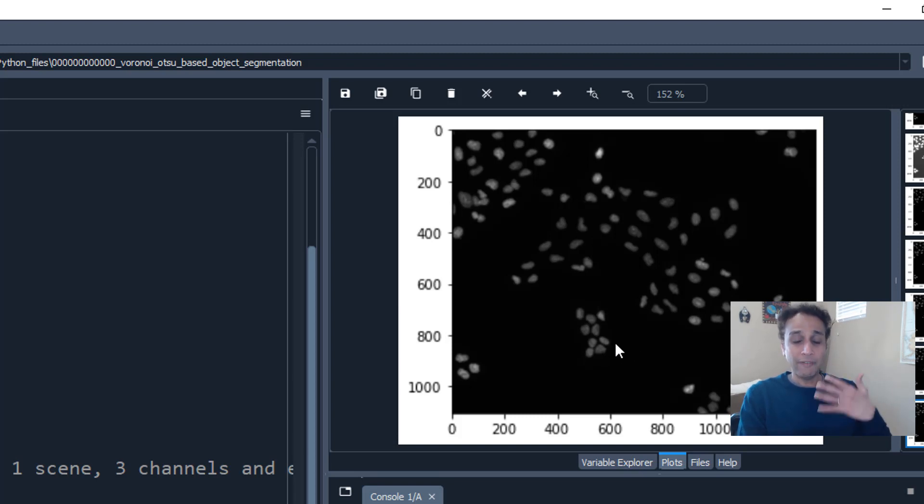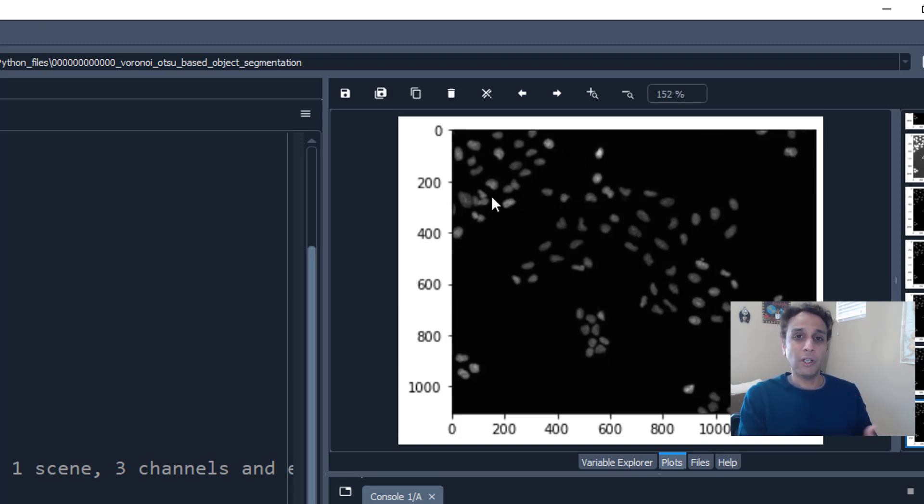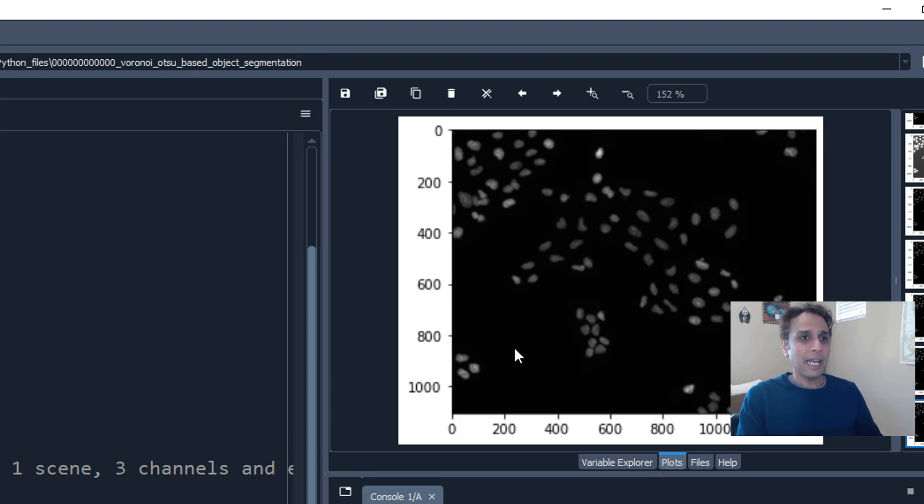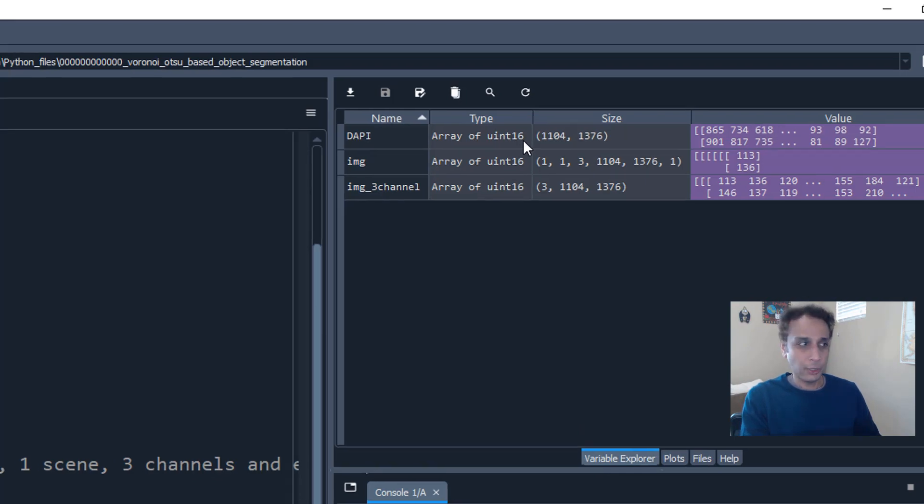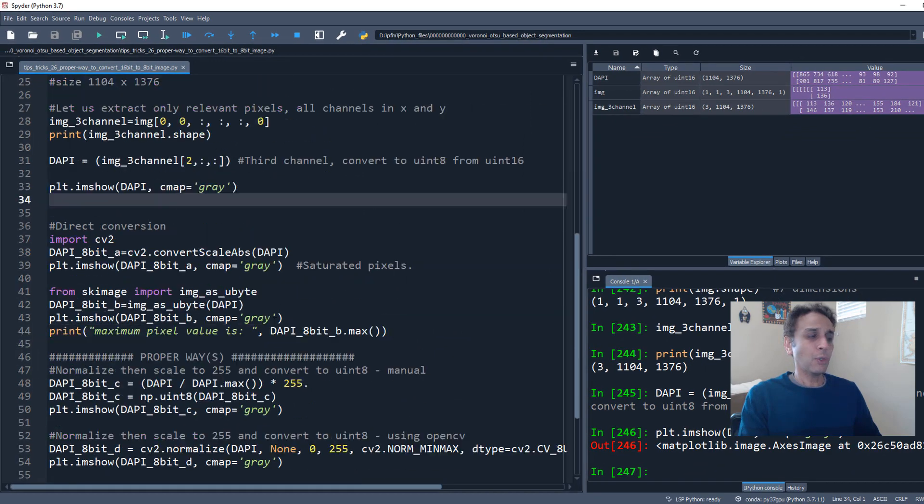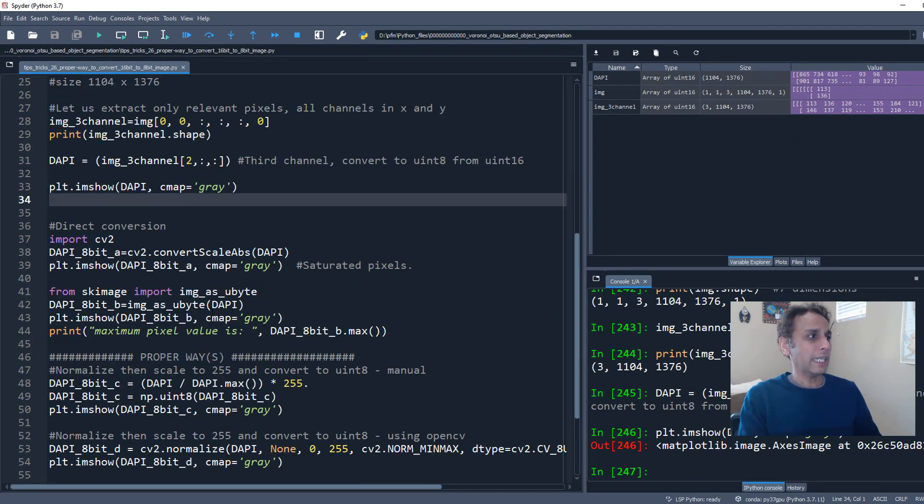And my goal eventually is to segment these nuclei, separate them, and get all the morphological parameters that I can. So for that, I do not need a 16-bit. If you look at my DAPI image, this is a 16-bit unsigned integer. I need to convert that into 8. So how do I do that?